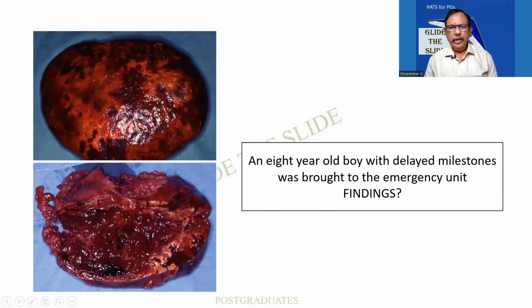One, it is a solid organ. Second, it has got a mildly reniform shape. Fine. So what can be the differentials? The cut surface, a lot of hemorrhage is there. Therefore, the other details, it is quite justifiable. But the external surface, I am finding multiple pale areas. Multiple pale areas. And then there is a dark, almost a slate gray or a dusky color specific for the organ. I hope we have made the diagnosis of the organ at least.